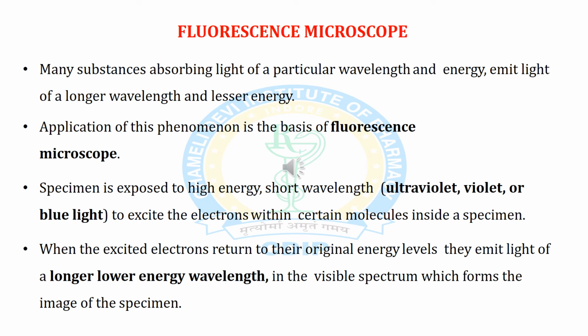Next one, or last one, is fluorescence microscope. Many substances absorbing light of a particular wavelength and energy emit light of a longer wavelength and lesser energy. The application of this phenomenon is the basis of fluorescence microscope.